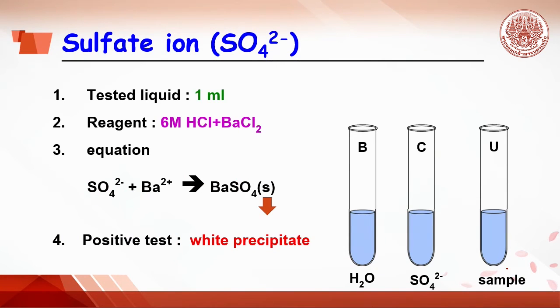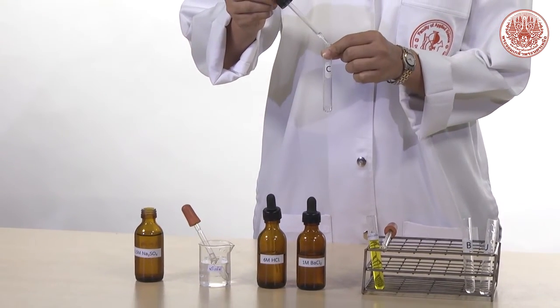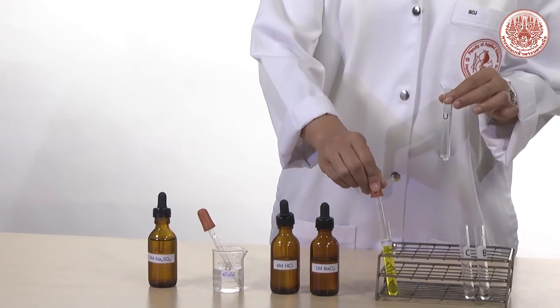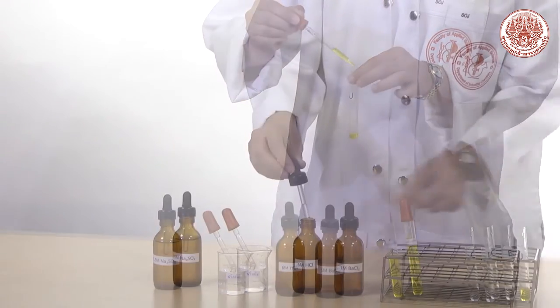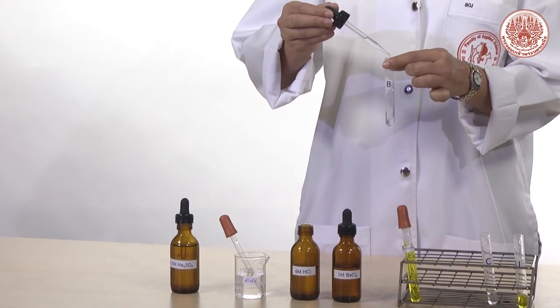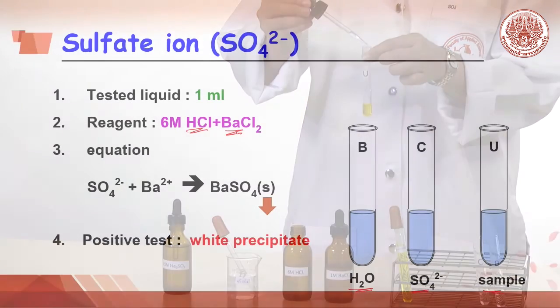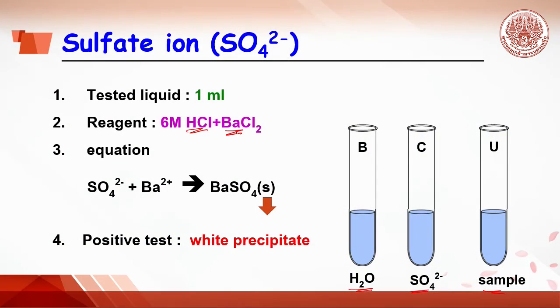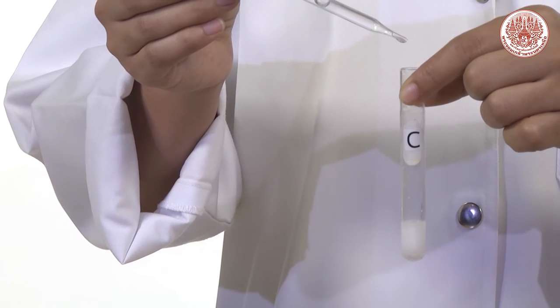Second ion is sulfate ion. Do the same for B tube, C tube and U tube by adding 20 drops of water, sulfate ion from sodium sulfate, and sample. The reagents are added by 20 drops of hydrochloric acid, followed by 2 or 3 drops of barium chloride. Sulfate ion will react with barium ion to get barium sulfate, which is a white precipitate.